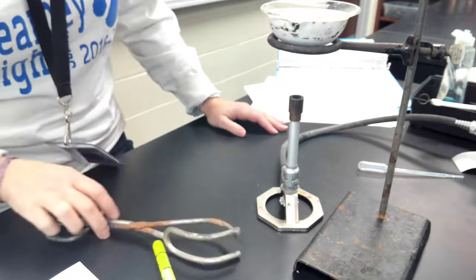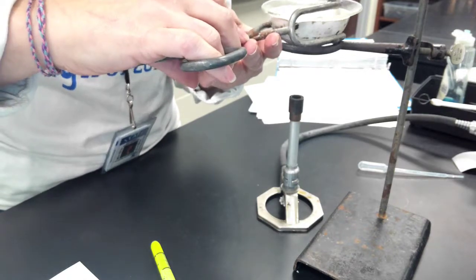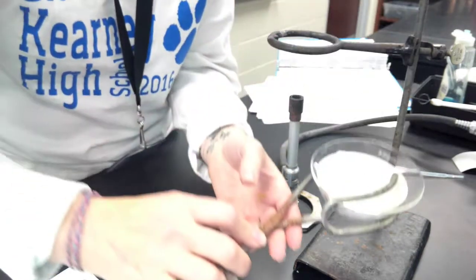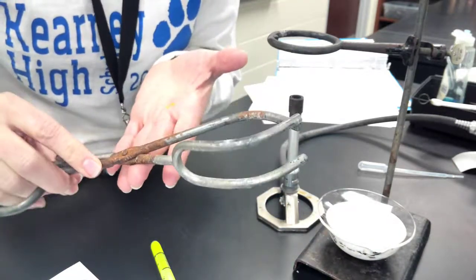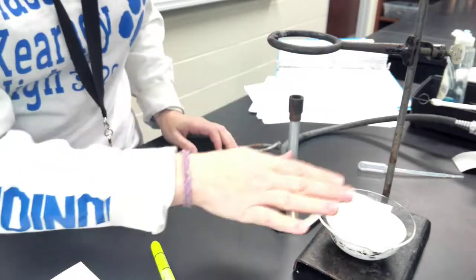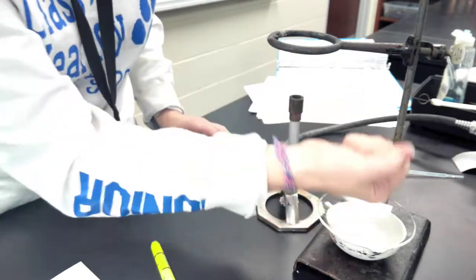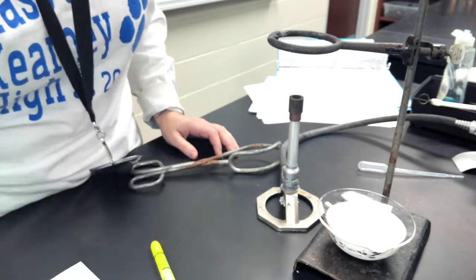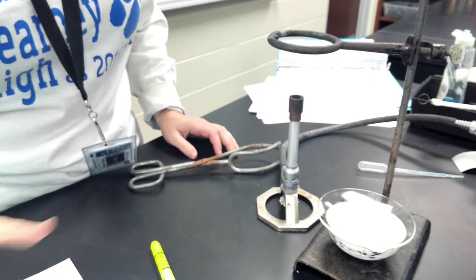Cool the evaporating dish with my sample and my watch glass. So cooling. We are masters of transferring here. Notice I put my support hand underneath the joints so that it helps me move things safely. So cool it a second time, and then after it's cool, check for heat. Once it's cool, I'm going to transfer it over to my electronic balance. I'm going to mass it on my electronic balance.